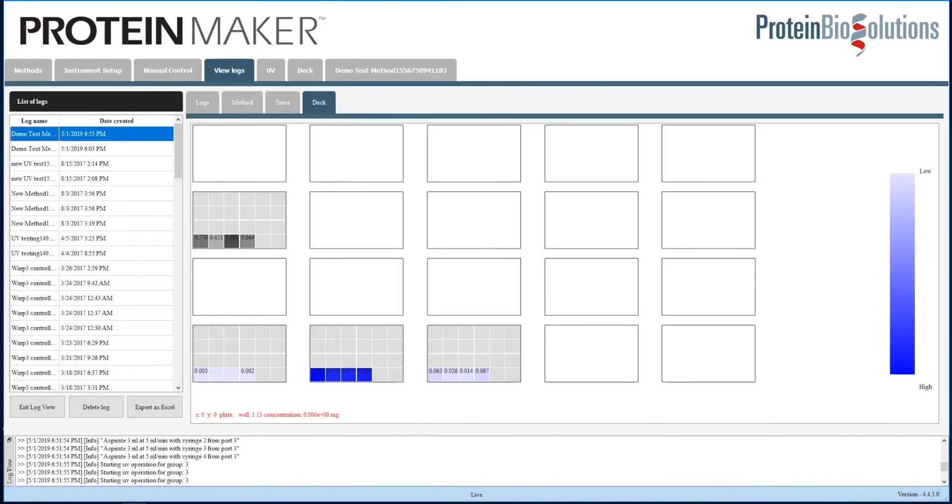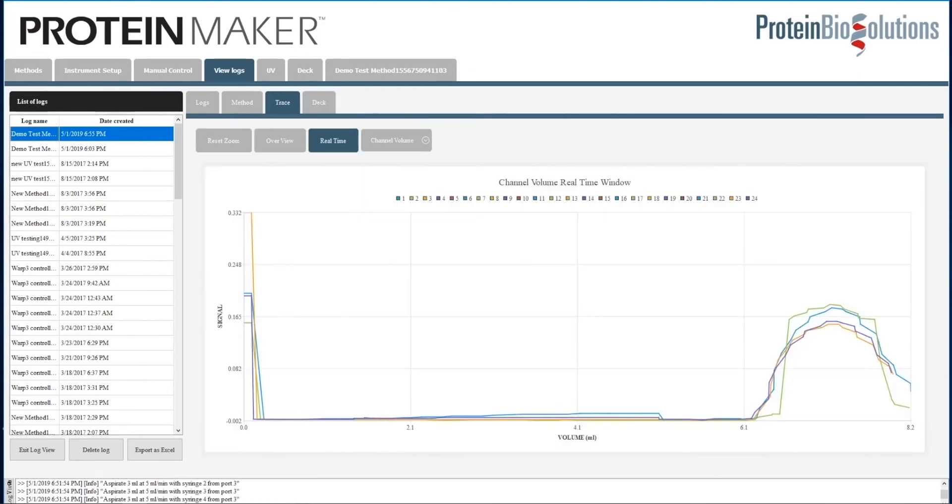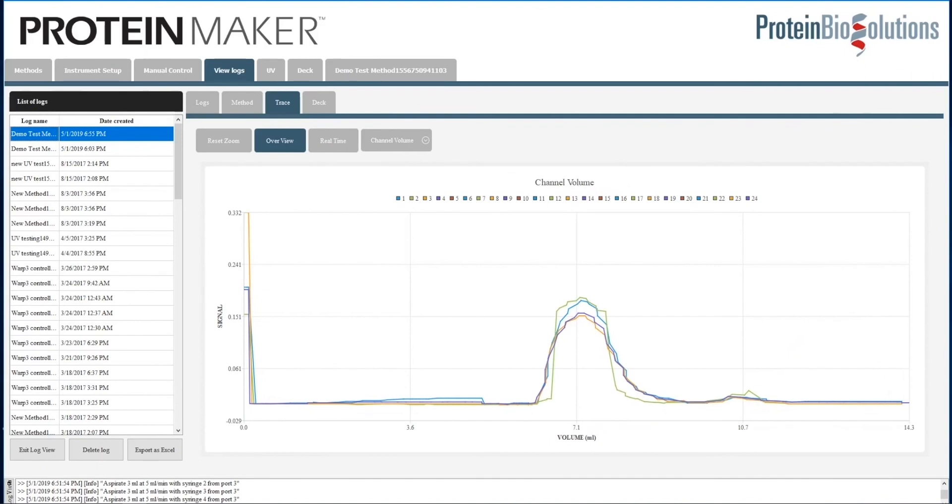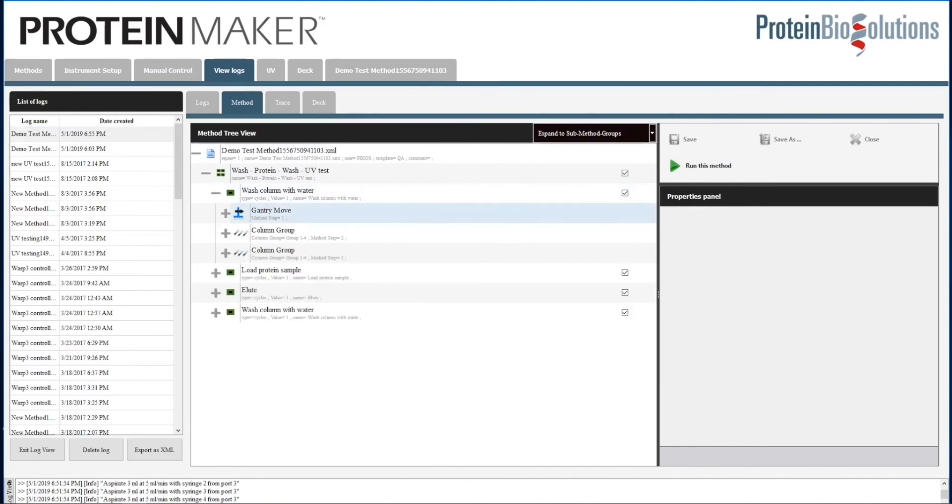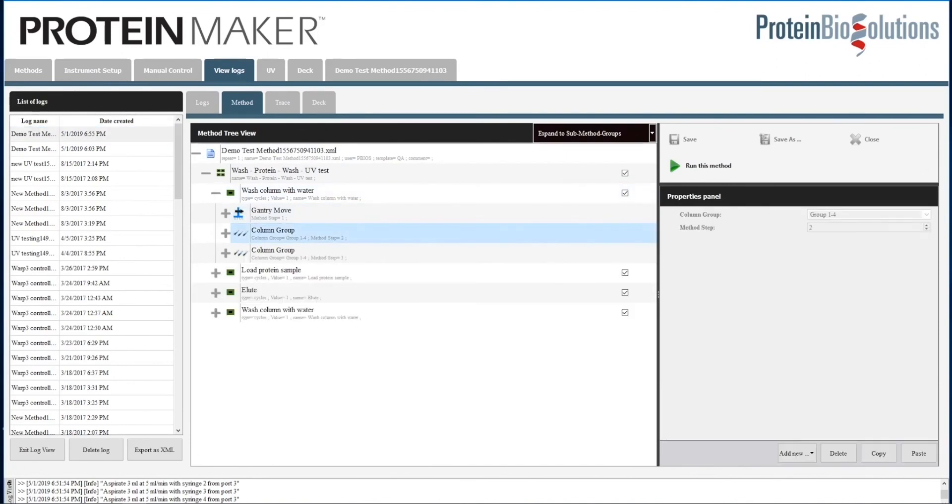There are several different logs. We have the deck log that we can interact with, and the UV log is also available to interact with zoom in and out. The method log shows the method we ran. It is no longer editable, but we can double check to see what was done.